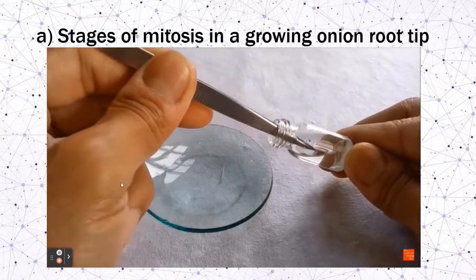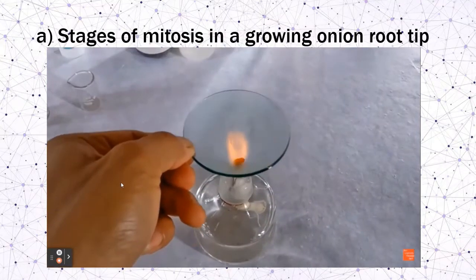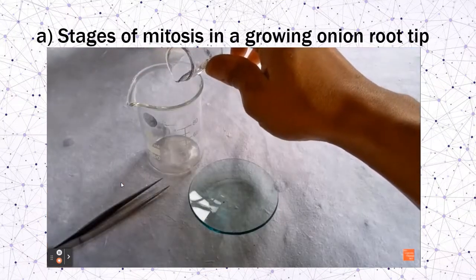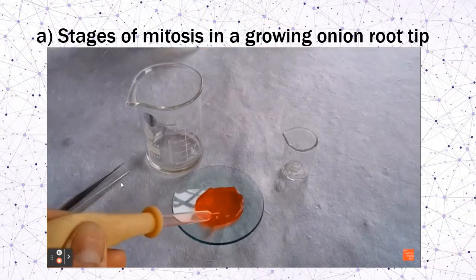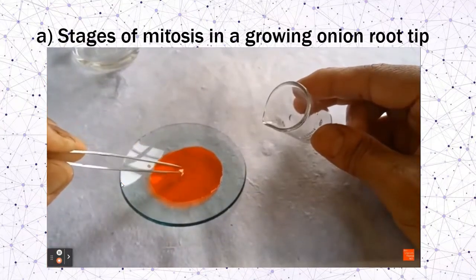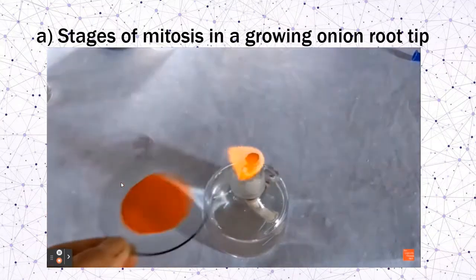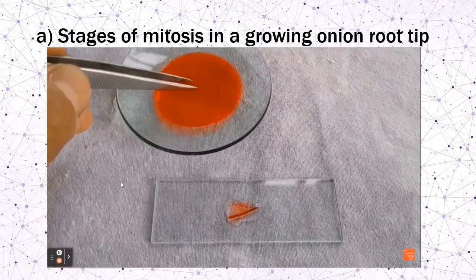Gently warm it on a plate for about five seconds and leave it for about two minutes. Give the root tip a couple of washes with distilled water. Then transfer the root into a watch glass containing acetocarmine or zinc acetocarmine. This is excellent for giving a deep red color to the nuclear material. Warm the stain for about five seconds and leave it for five to ten minutes.